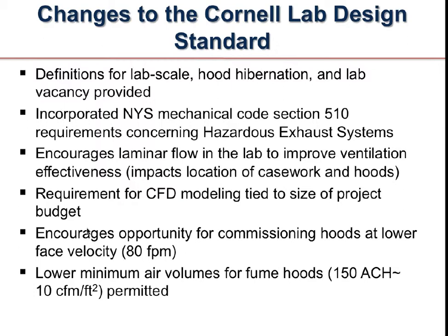We have an active hood hibernation. It's a temporary decommissioning, but we have termed it hood hibernation. We have an active process for doing that. We wanted to define that within the design standard because what we've noticed is that in some labs we simply can't hibernate them. There's no general exhaust to be able to turn off the fume hood, or mechanically it's not possible. We needed to define lab vacancy, which if you're a newcomer, vacancy is not something that's widely known, so we wanted a place for that to land. That's basically where we have a lab that is unassigned and the ventilation is practically off, and that saves energy.